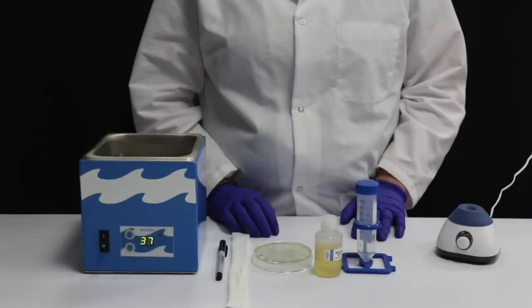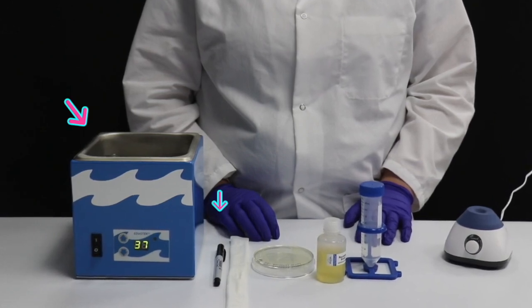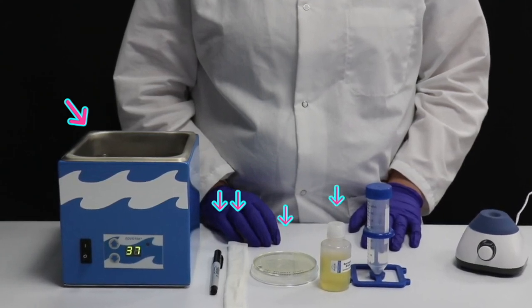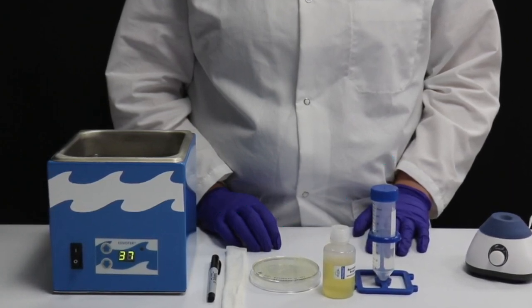Step 2: Preparation of E. coli Starter Culture. To create the E. coli Starter Culture, you will need a water bath set to 37 degrees Celsius, a permanent marker, a sterile inoculating loop, a source plate that has been grown between 18 to 22 hours, recovery broth, a 50 ml conical tube, and a vortexer.